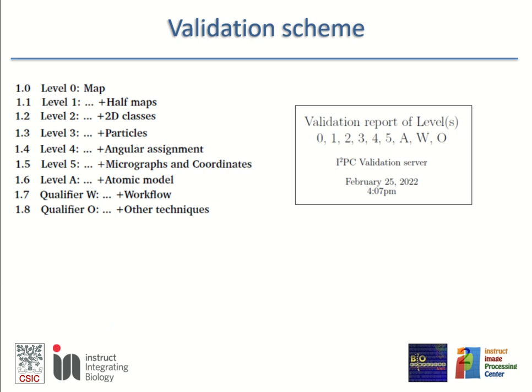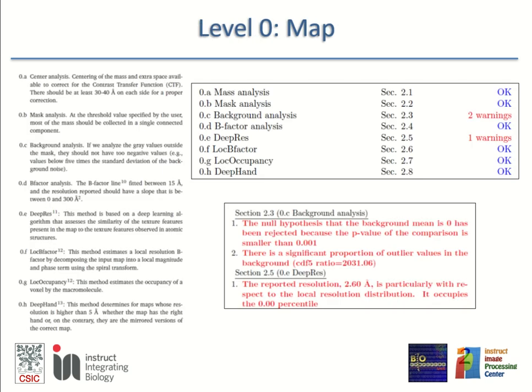All this information can be put together into a PDF report, and let's see how this report looks. Let's say that you have only the map. With only the map, there are already a number of things that you can check. For instance, you can check whether the map is correctly centered, because you need extra space around the structure in order to correct properly the CTF.